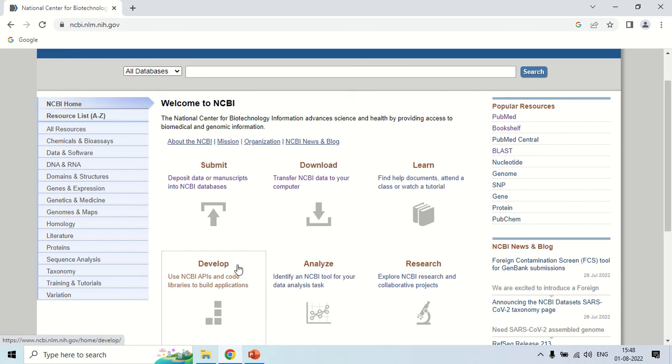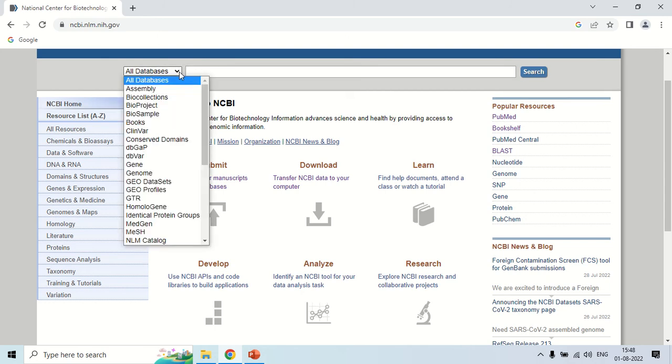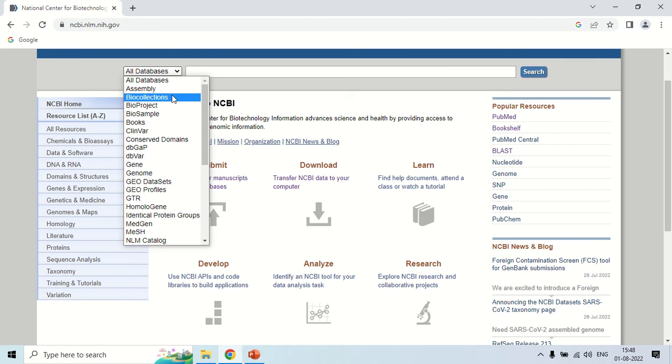Now the main option is this search box, which is the entrance. Here you can search different genes or organisms or different molecules among different databases. You can see the names of many databases like assembly, bio collection, bio project, etc. But I am going to tell you just a few important ones in this video.